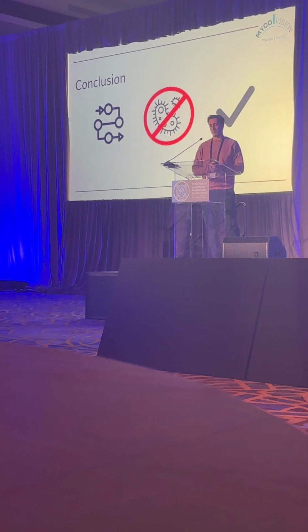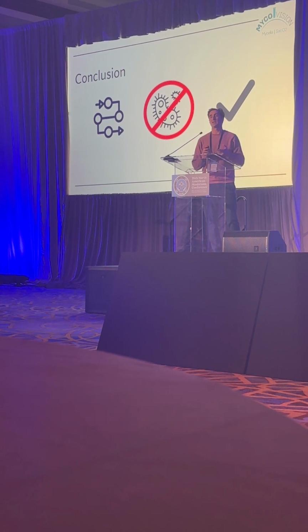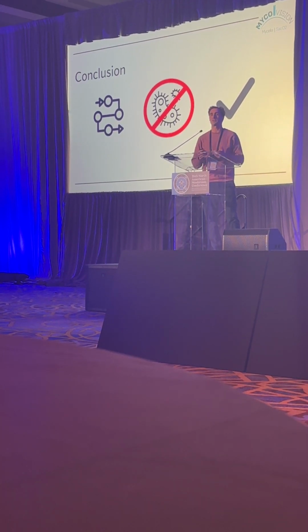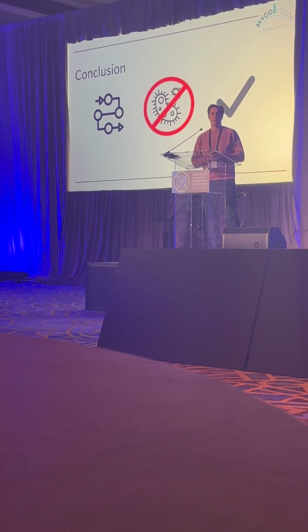And then most importantly, I think, is that we are measuring actively what is going on in growing spawn. We are not using Petri plates and a climatized room and sensing the climate in those rooms. It's actively measuring carbon dioxide and oxygen levels in growing spawn.